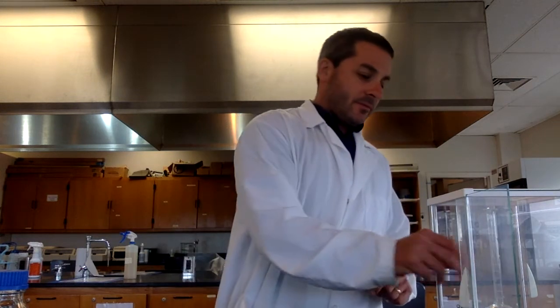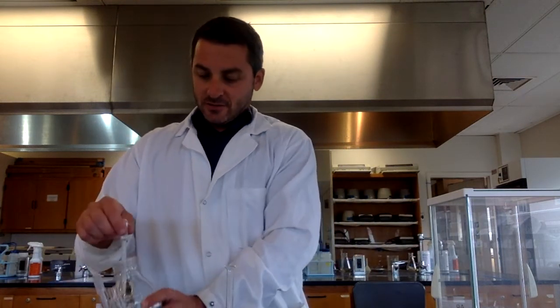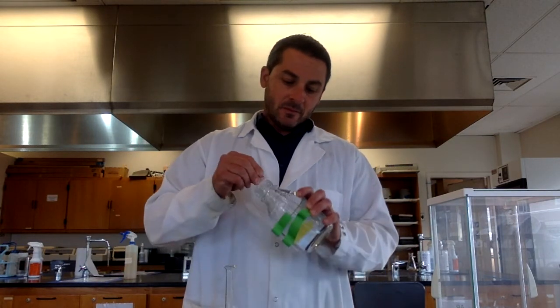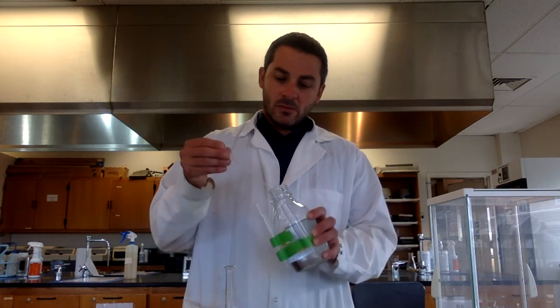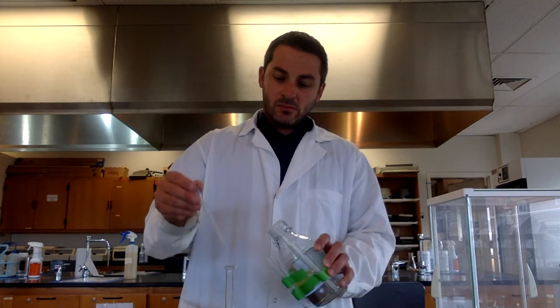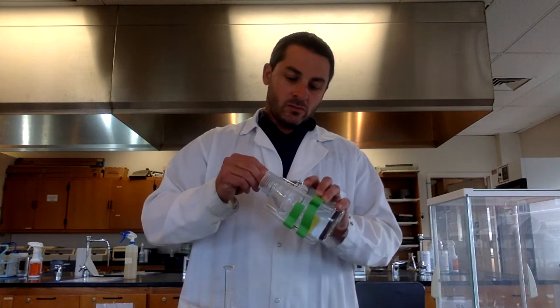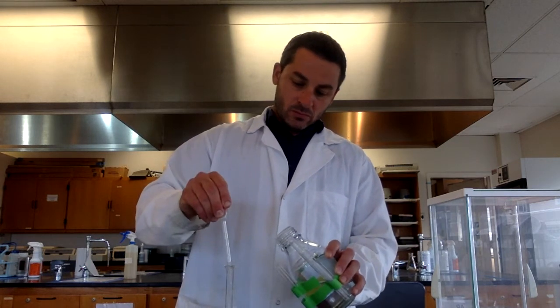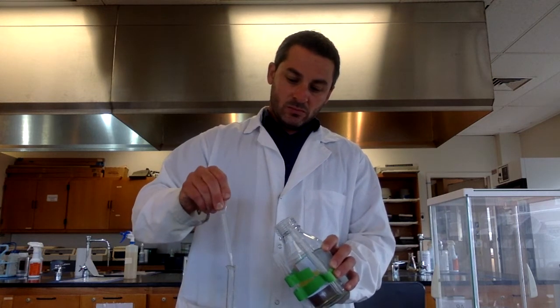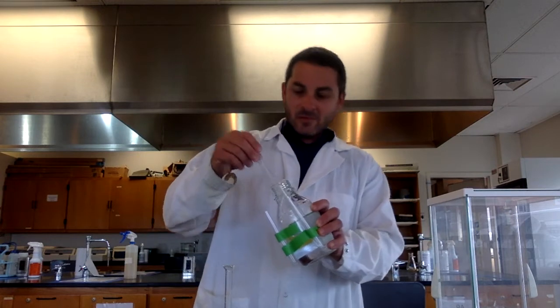Now, I'm going to add between 5 and 6 milliliters of this mysterious liquid to the graduated cylinder. Perfect.